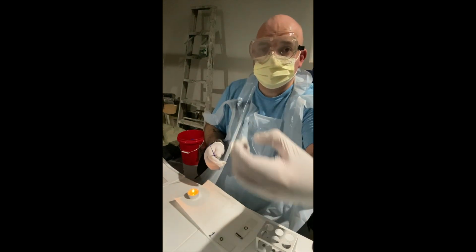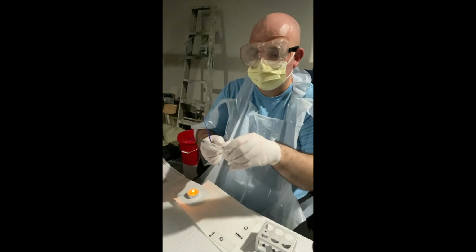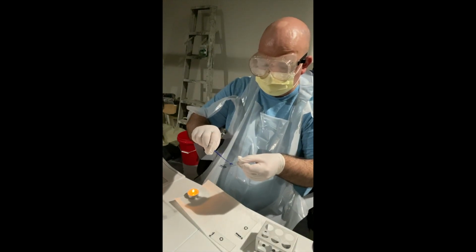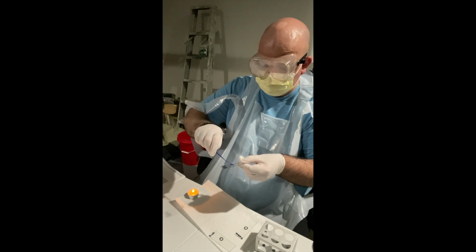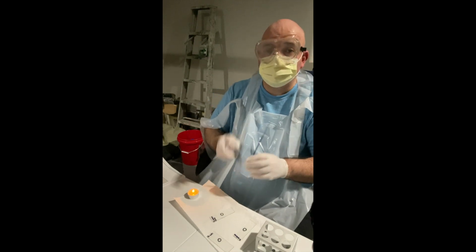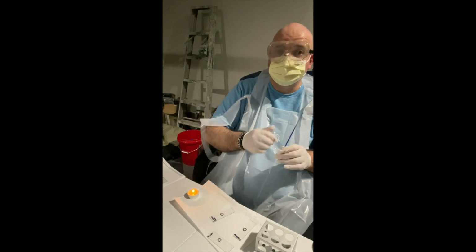And again, this is my S. cerevisiae slide. I'm just going to place the loop here against this white circle. Or the circle I drew, not the white circle, this black circle I drew. Okay. And now all three have to completely dry before I proceed to the next step.